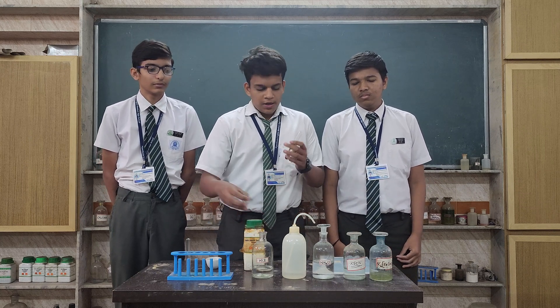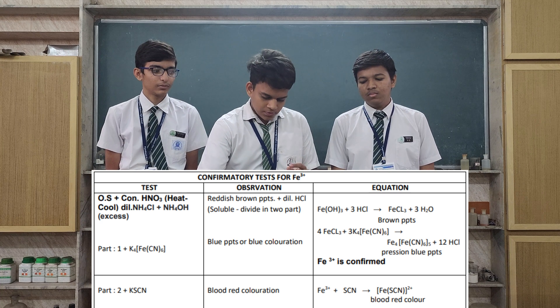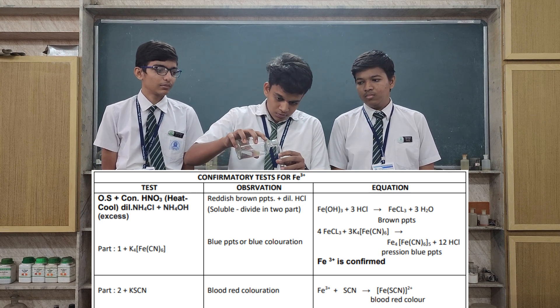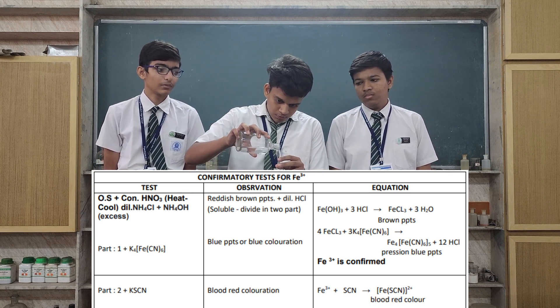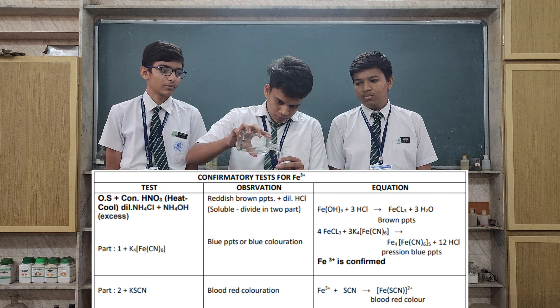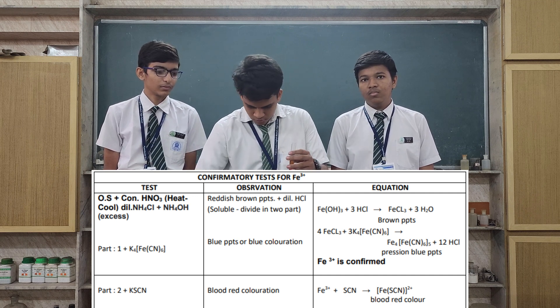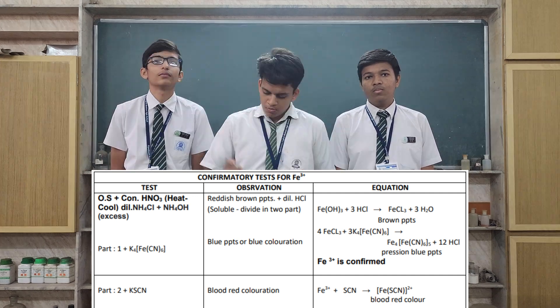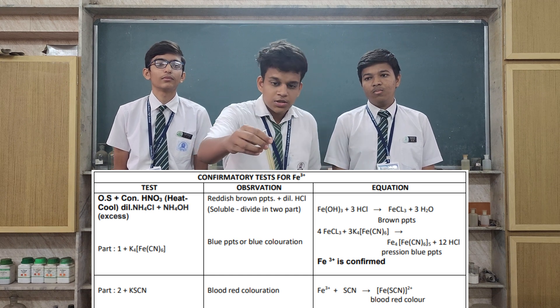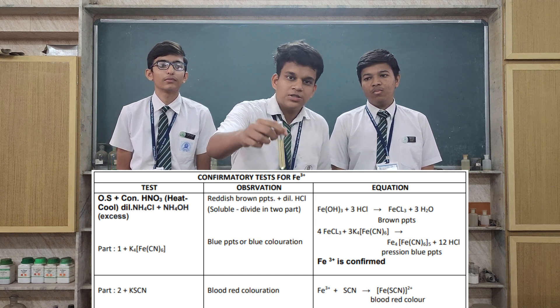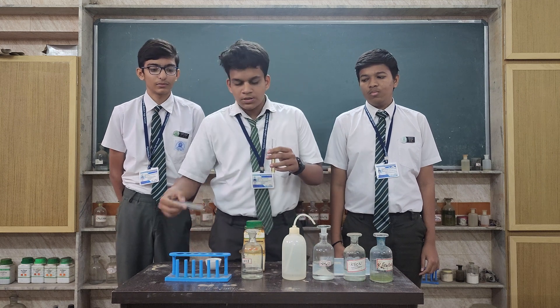Now dissolve the precipitate in HCl. As you can see, the precipitate is completely dissolved. Now divide it into 2 parts.